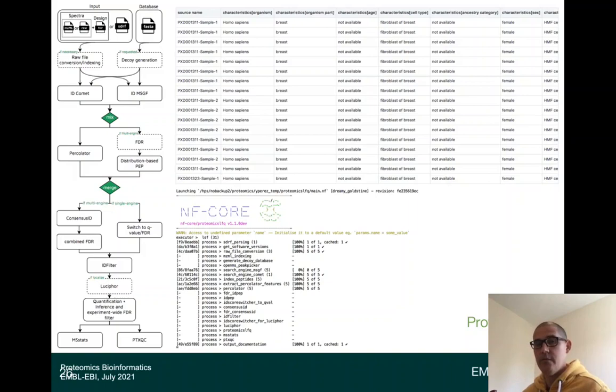That means that instead of converting all of them one after another, you send the files to different machines and convert them at the same time, so you reduce the time of performing each task, but it depends on the number of compute resources that you can allocate.